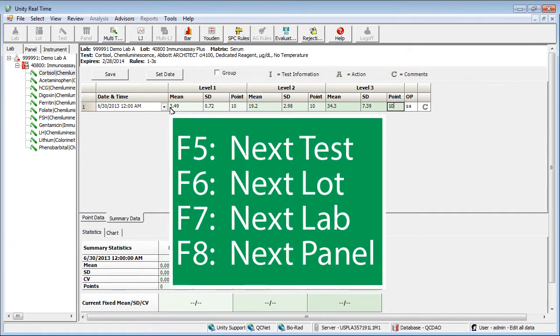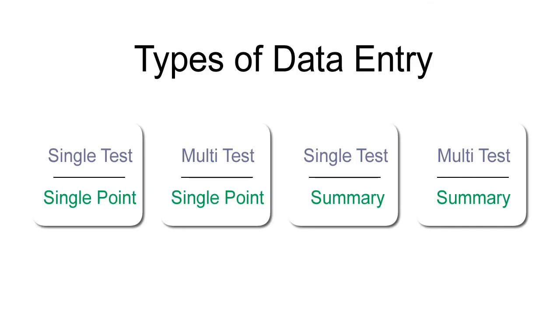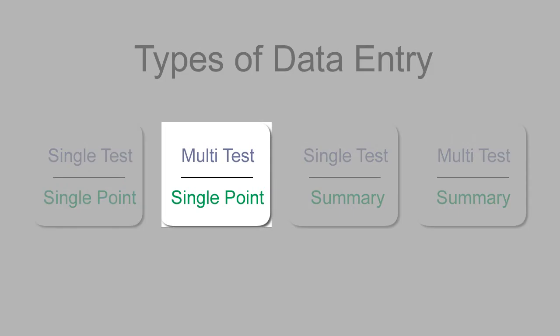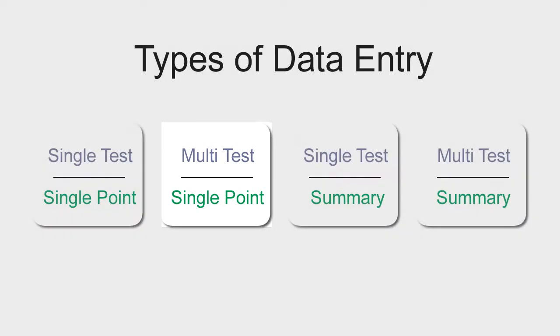You can use a function key to move to the next item. Now we'll take a look at entering single point data for multiple tests at the same time.